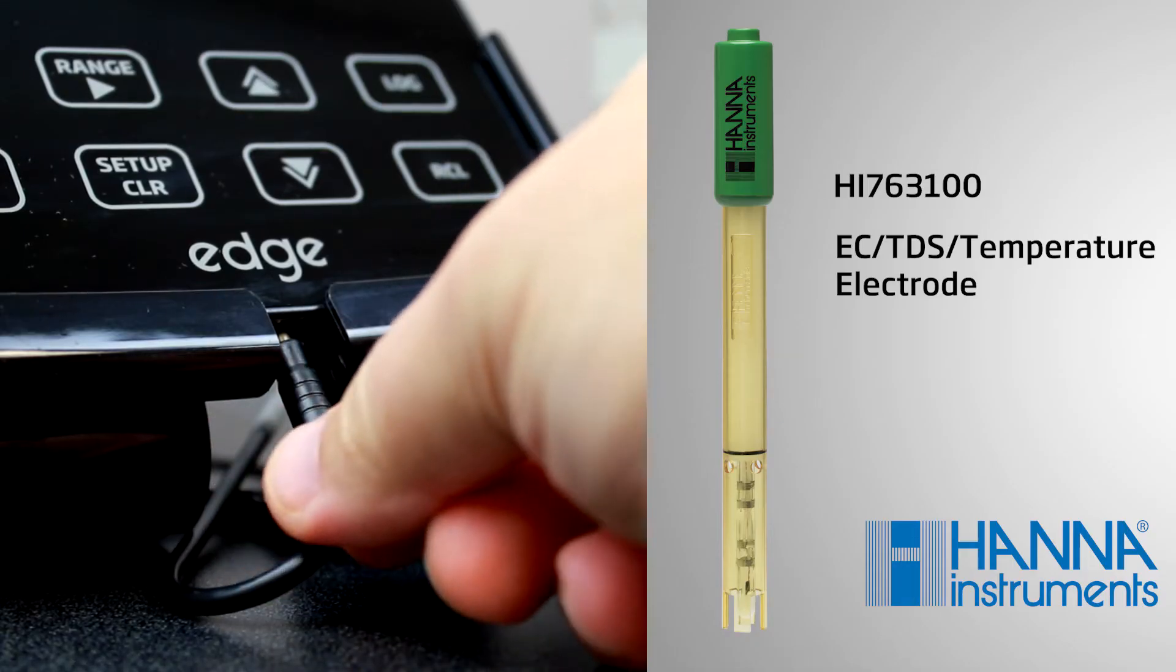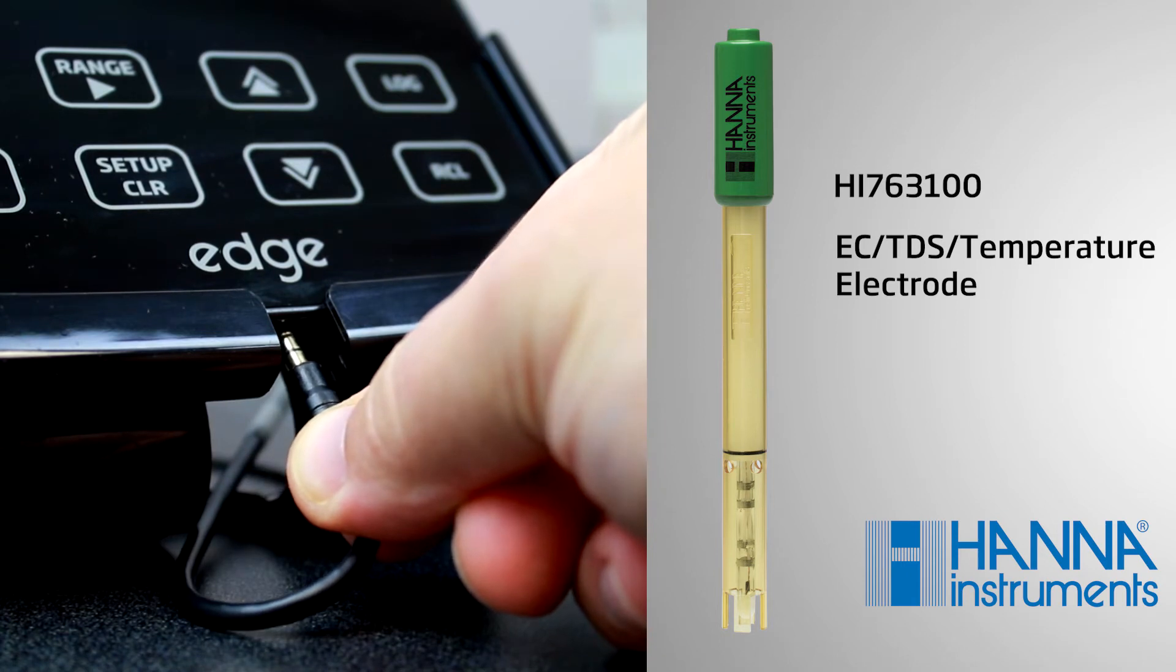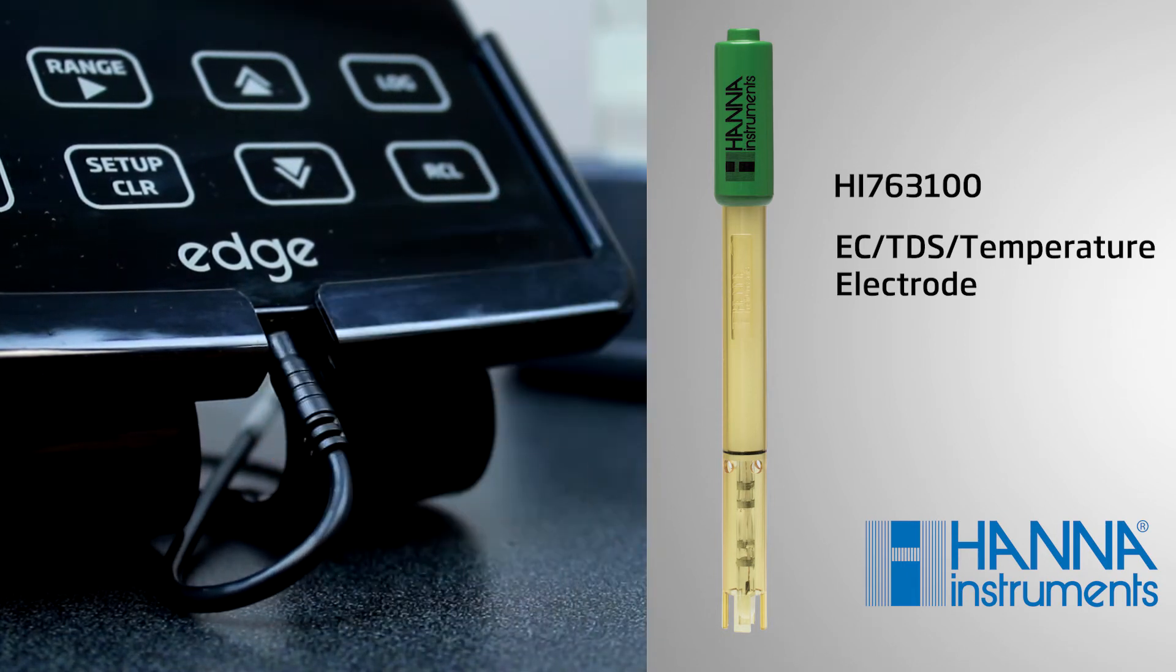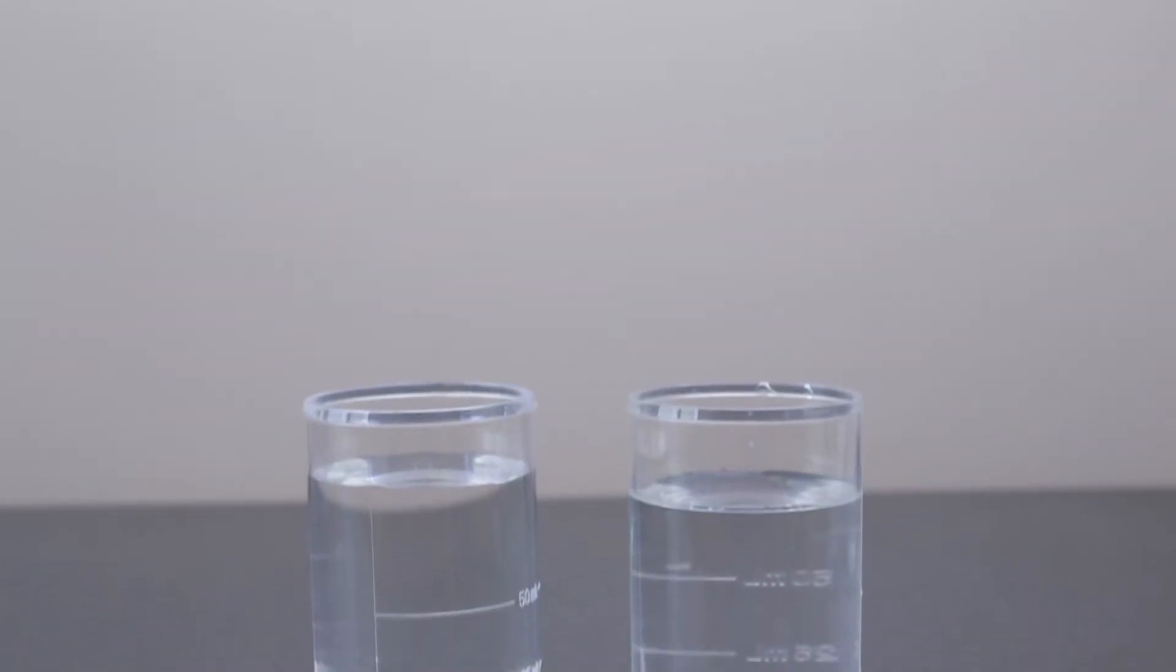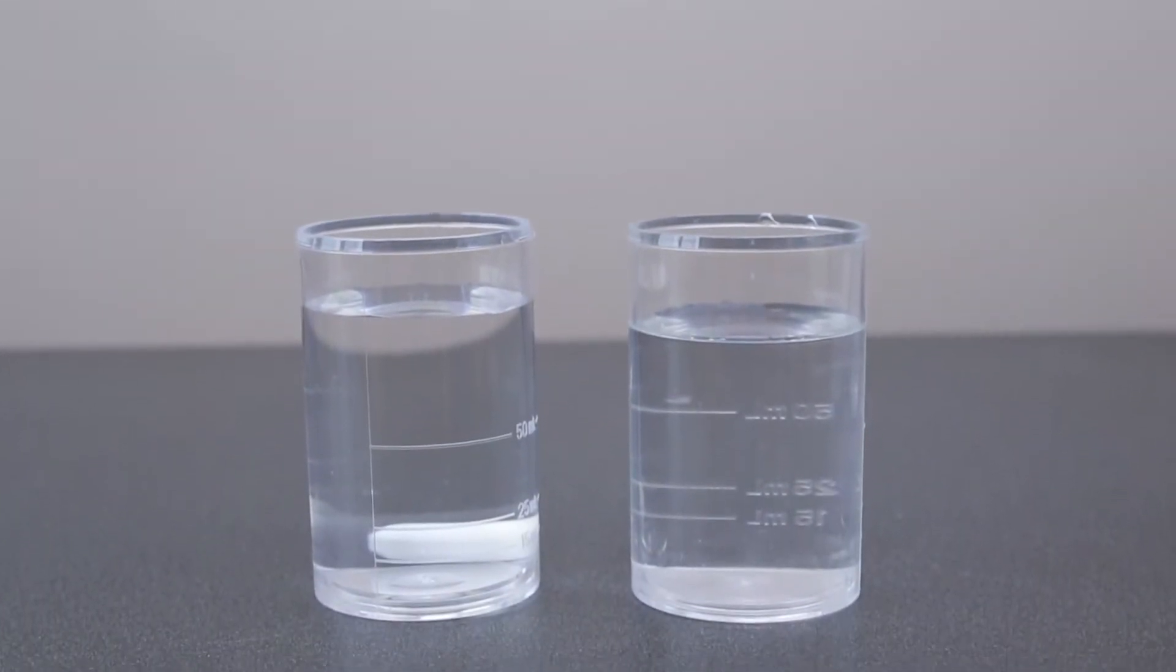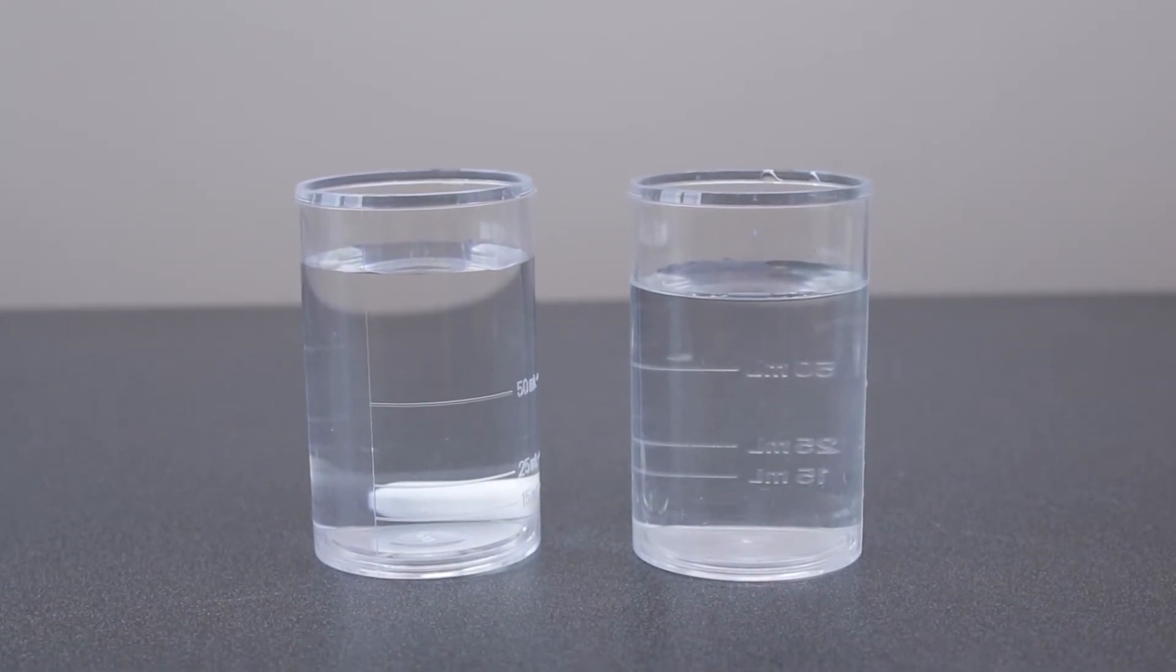For EC-TDS calibration, plug the HANA HI763100 EC temperature electrode into the meter. For accurate calibration and to minimize cross-contamination, use two beakers for the calibration standard—one for rinsing the probe and one for calibration. Use plastic beakers to minimize any EMC interferences.